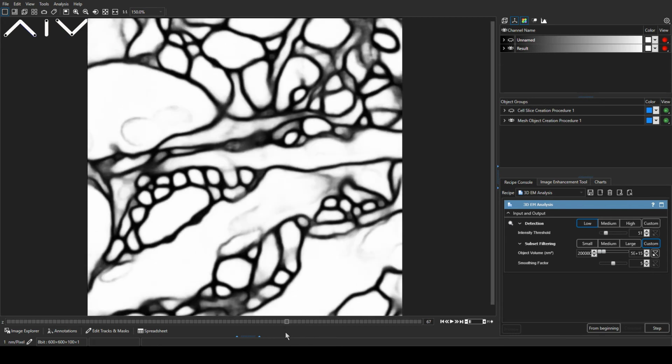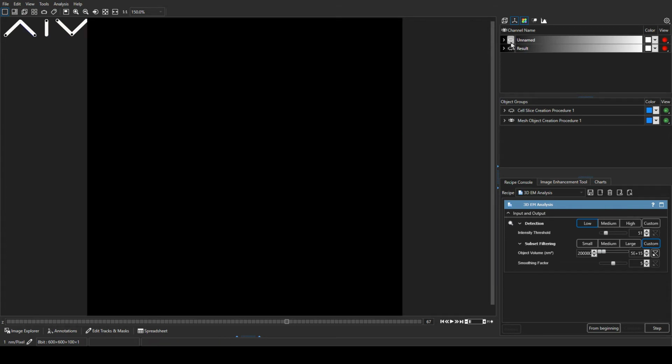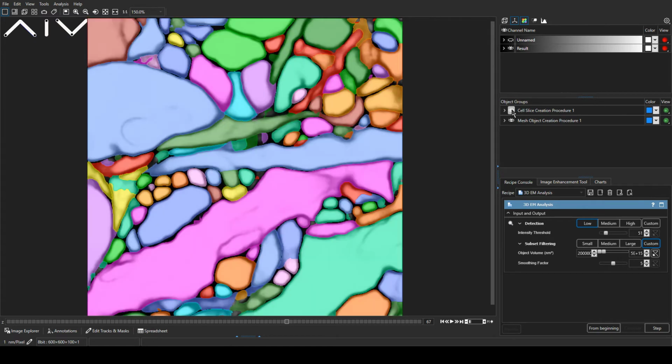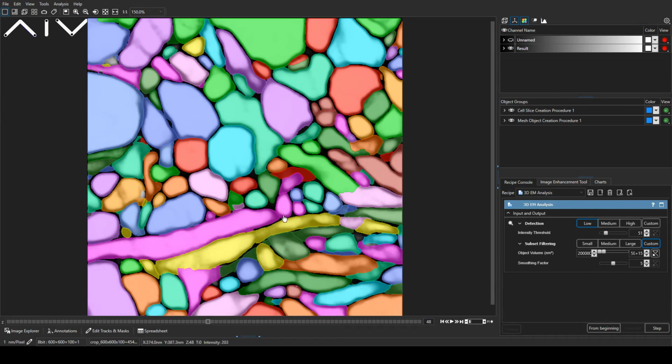And in some places, you can still see shadows of internal structures, because that's a very strong internal structure, very high contrast, so you still see them there, and sometimes that can mess up our segmentation. In this case it didn't, but it can, and so there is tuning to be done with additional small training data sets.